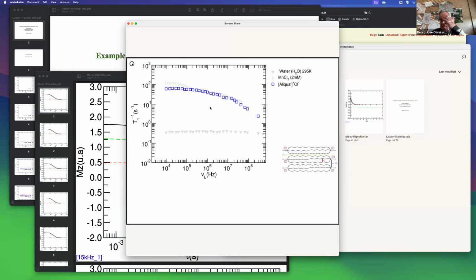There's a nitrogen atom here and some long chains and a smaller chain, and these molecules pack together, but they produce a dispersion profile that, funnily enough, falls in the same area where we find the manganese chloride and water solution. There is no relation between these two systems, but the profile stays in the same place.